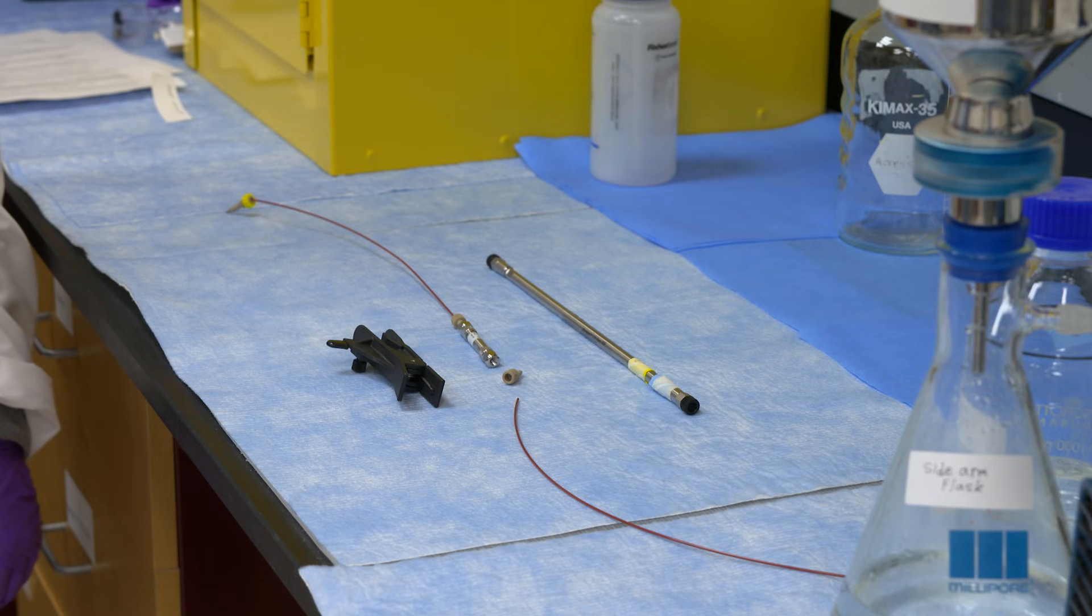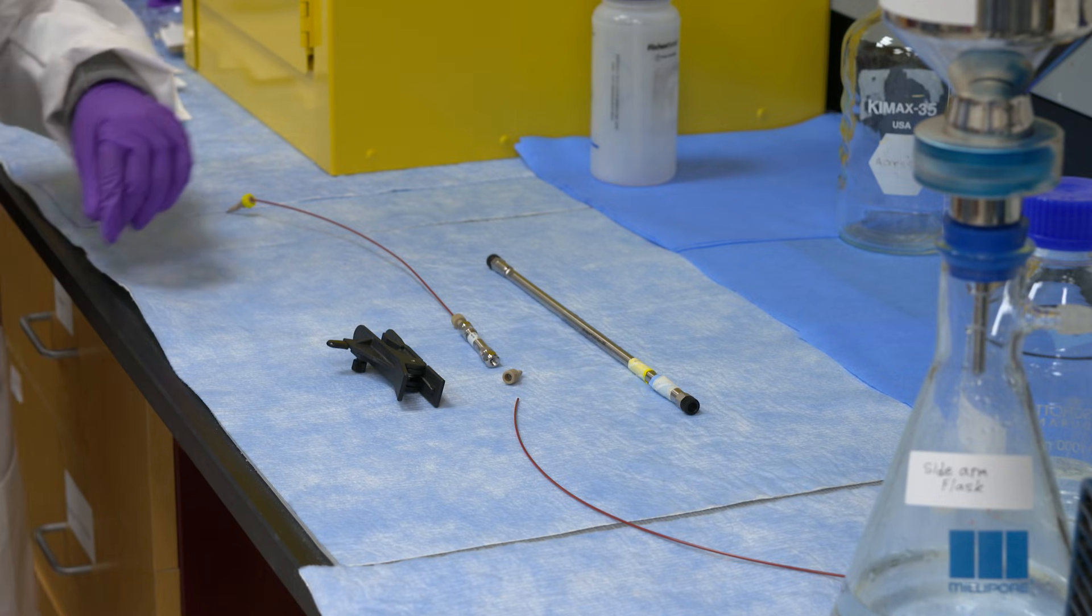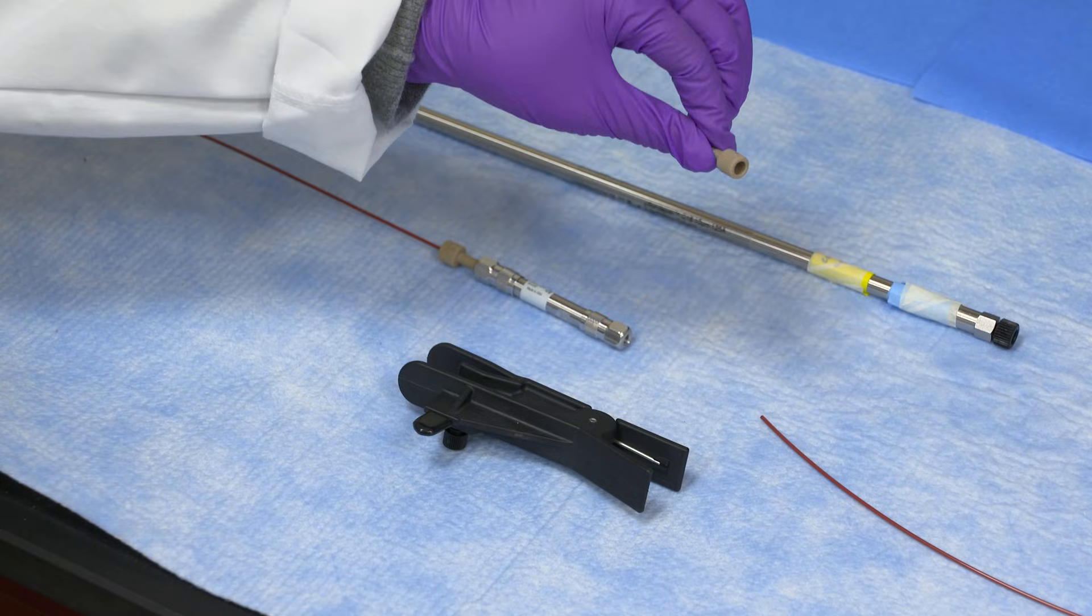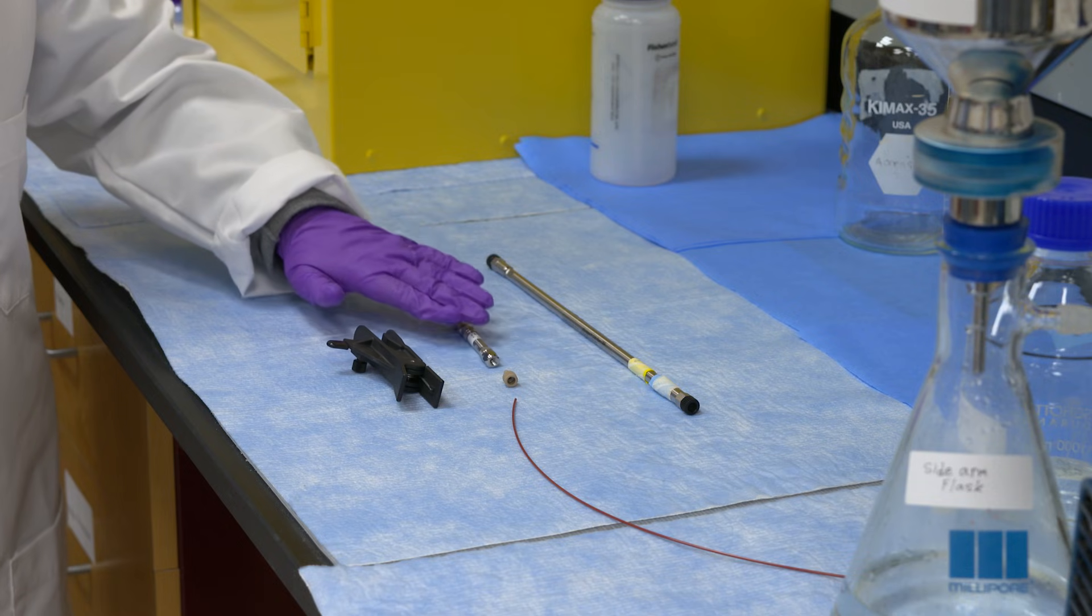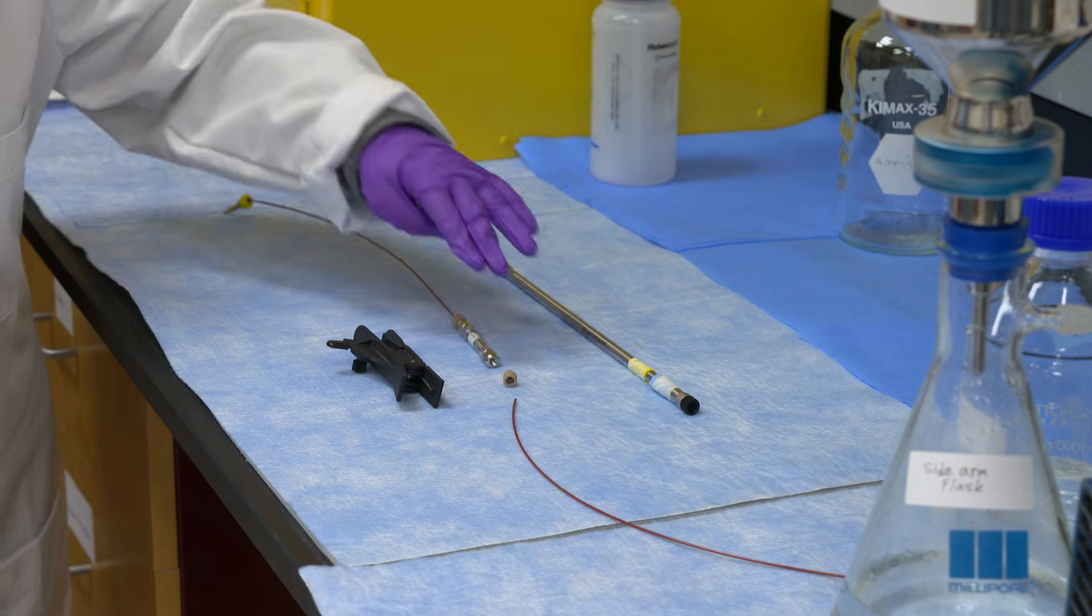Now, we will talk about the selection of the column and attaching it to a ferrule. This is called a ferrule. For this setup, you will need a peak tubing, cutter, column, and ferrule on each end.